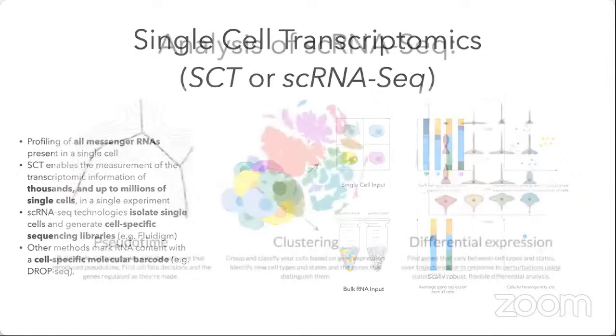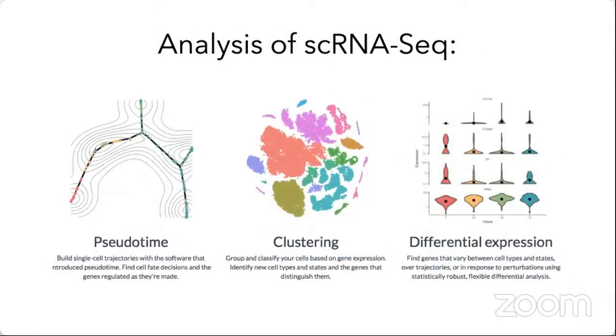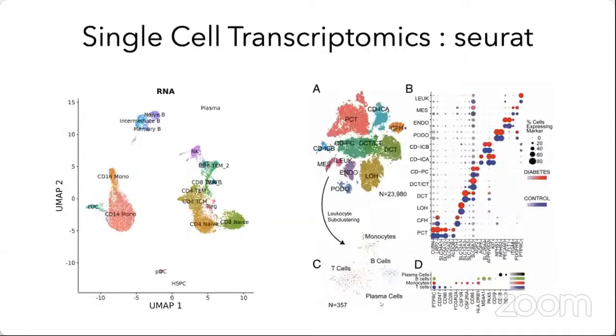Let's quickly skip through a couple of these parts. We have one more program to cover. This shows the power of single cell pipeline analysis, where you can get the different cell types that populate a tissue, so that you can understand the heterogeneity of the tissue you are analyzing in a much clearer fashion. This level of resolution you will not obtain from bulk cell RNA analysis. Single cell RNA analysis complements the bulk cell RNA understanding of disease biology in a novel and upcoming fashion.